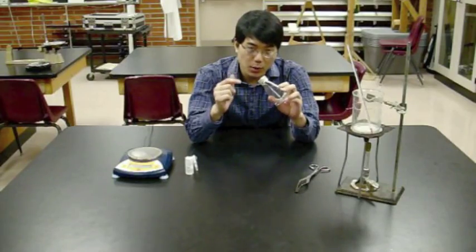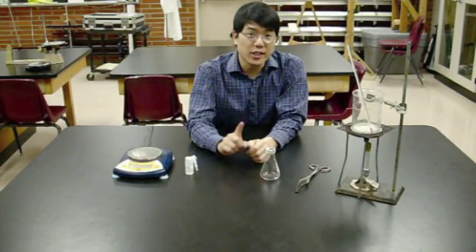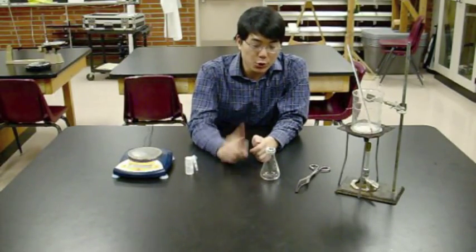That's your Dumas tube: Erlenmeyer flask, aluminum foil cap, rubber bands around the edge. Before you go any further, there's an absolutely essential thing to do.